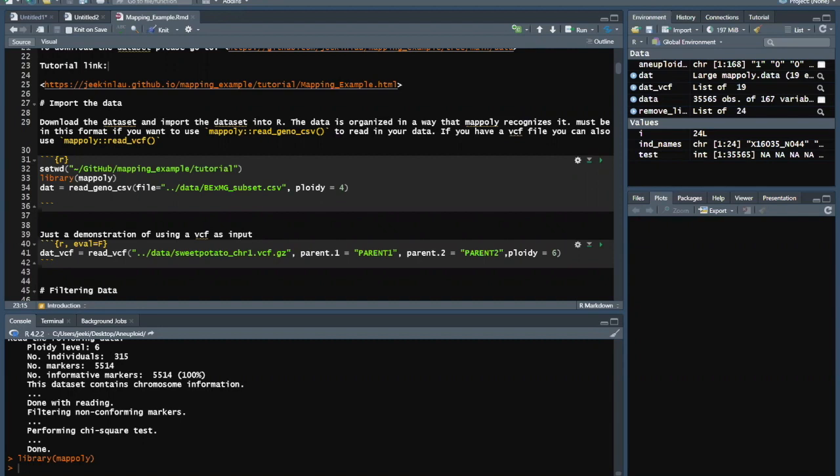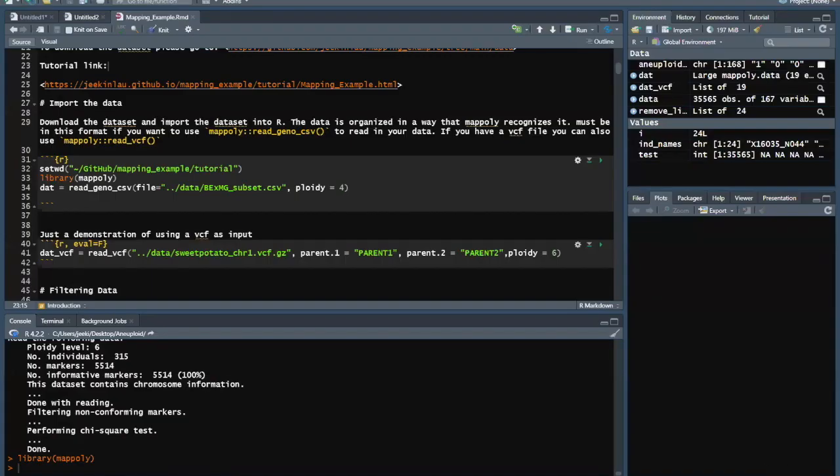Yes, I think in the last session I was telling about how to do the genotype calling and the SNP calling to try to avoid the errors. The issue with GBS is that you have much more genotyping error than the array, at least the ones that we have here. So we have many strategies to filter the markers before going to this stage. So yes, I can share with you some of our works that explain a little bit of the filters that you can use in your data too. I will share here in the chat.